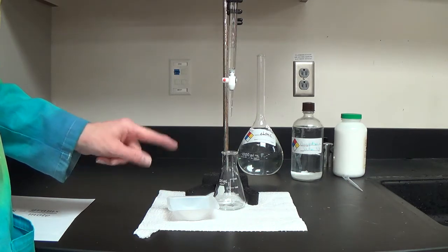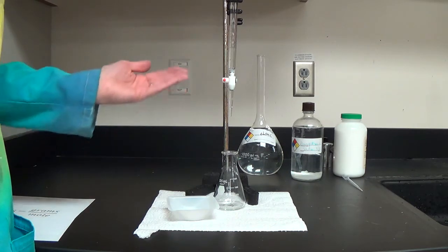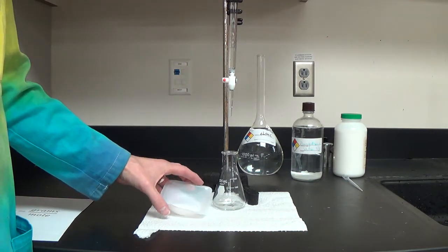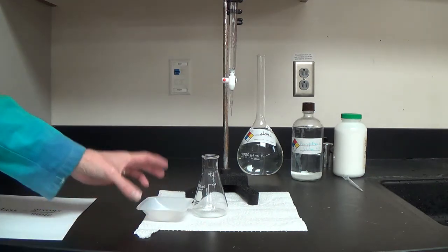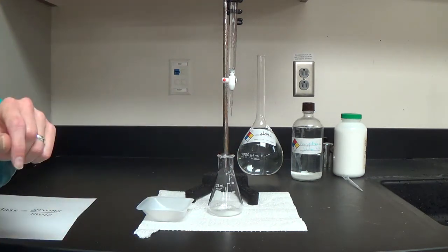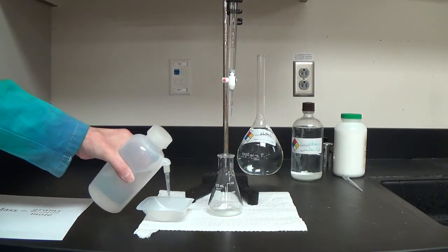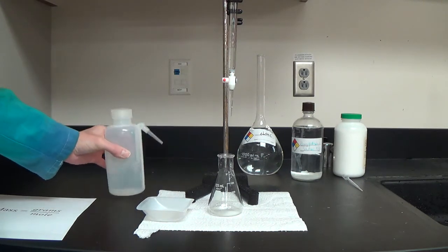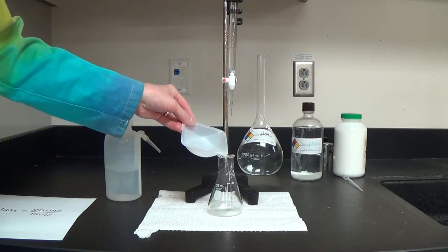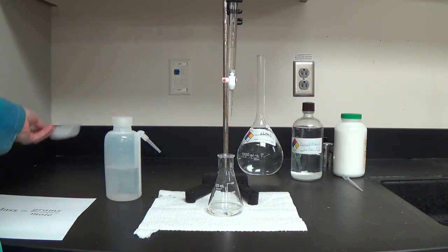So I've measured out 1.67 grams — I dumped some in and that's what the scale told me. I'm going to take that and put it into my flask. I can see there's still some clinging to the weigh boat, but that's alright because I was going to add water to my flask anyway. So I'm adding some water to my weigh boat and pouring down the same corner I poured the solid down. I'm fairly certain all the solid is now out of my weigh boat and into the flask.